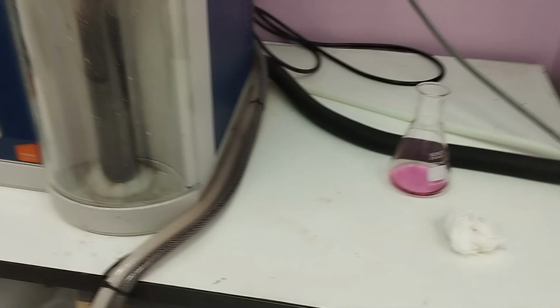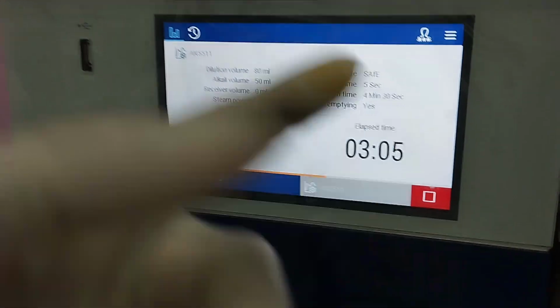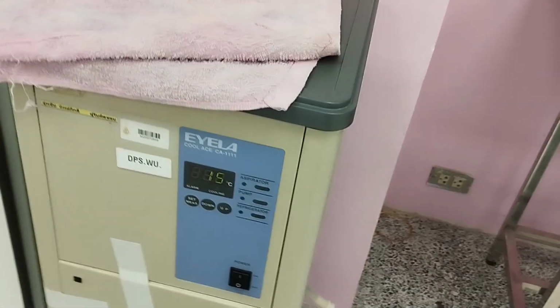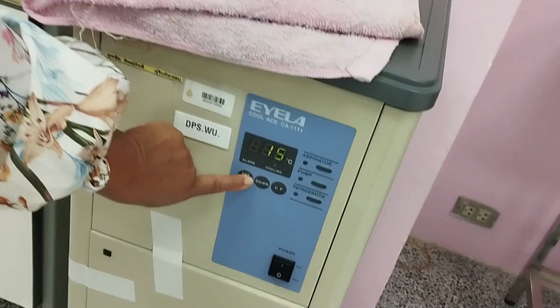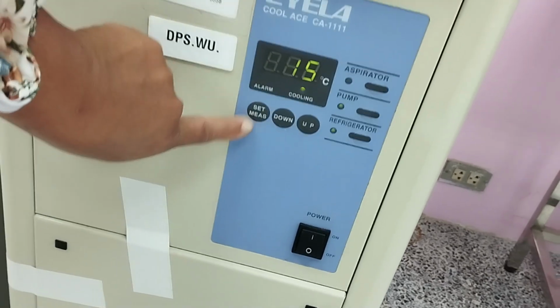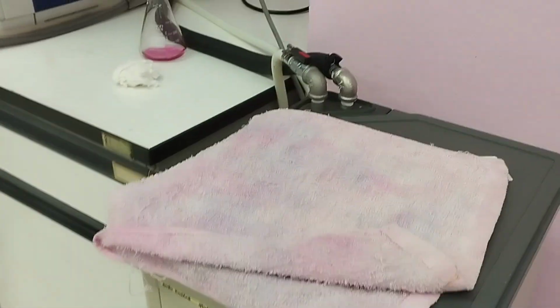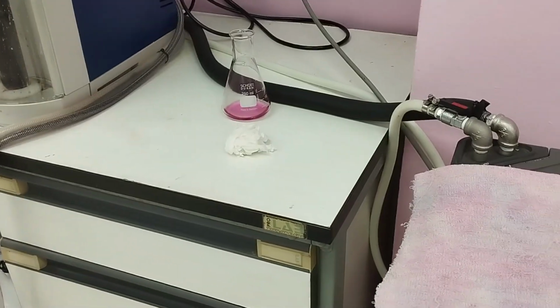Switch on from the back and start. This is auto program. And this, cooling. At what temperature? Set 10. Okay, and 10, and then start the process.